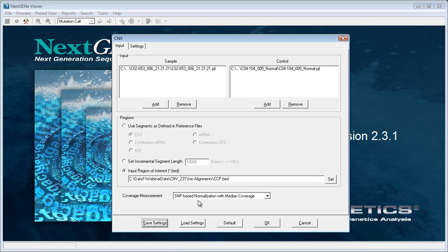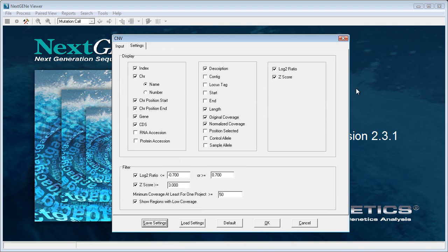Our normalization method performs a global normalization using the coverage at likely true heterozygous SNP positions, and performs that global normalization based on the median coverage in each project at those positions. It then looks at each region and generates a log2 ratio and a z-score. If the coverage in both projects is below a certain level, the calculations will not be performed because they're considered unreliable.